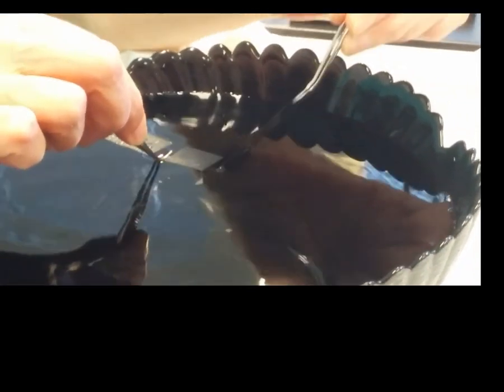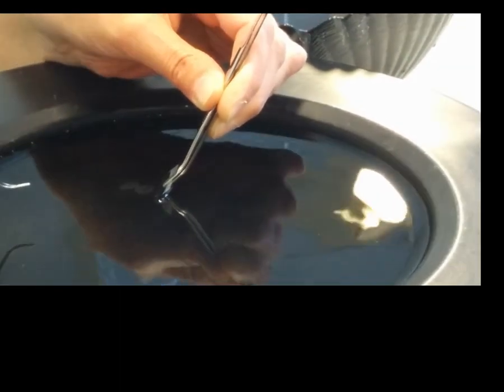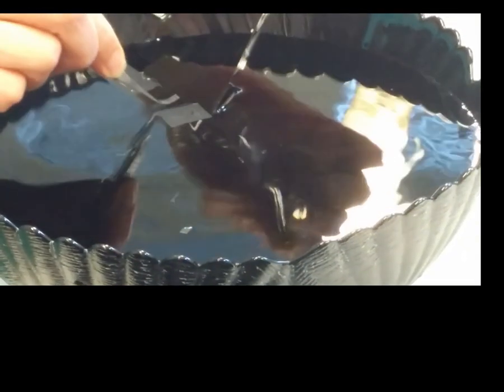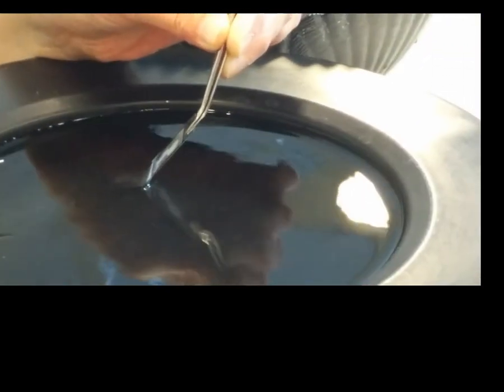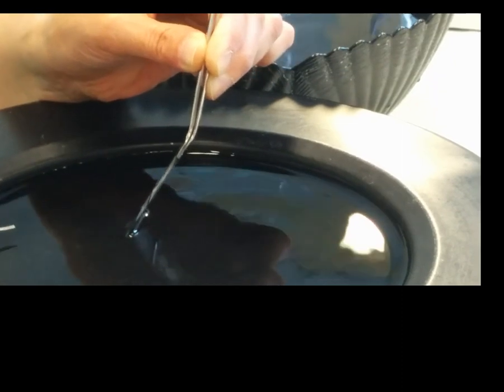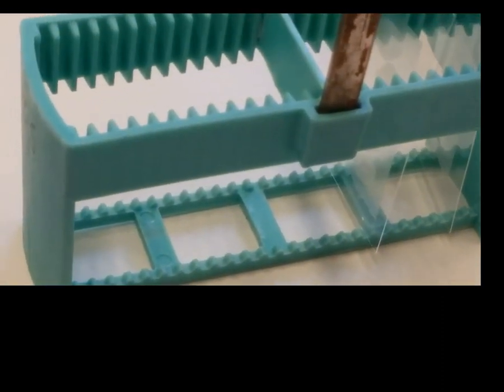But now, instead of a slide, she will use a cover slip to put the section on. You can also add several sections on the same cover slip, as you will see in a few seconds. The cover slip fits in the racks usually used for the slides.